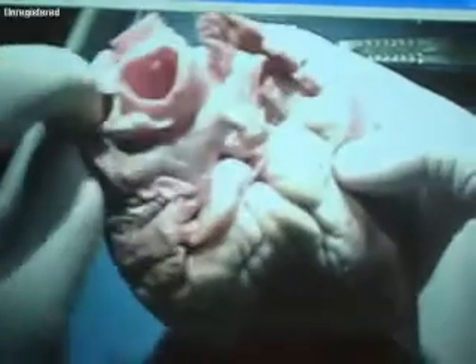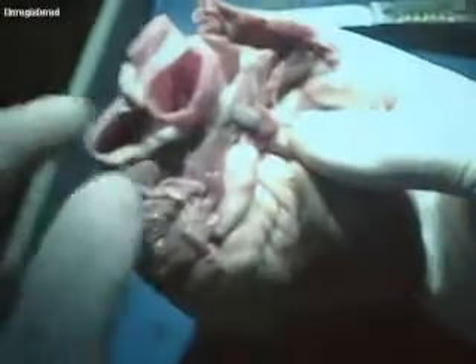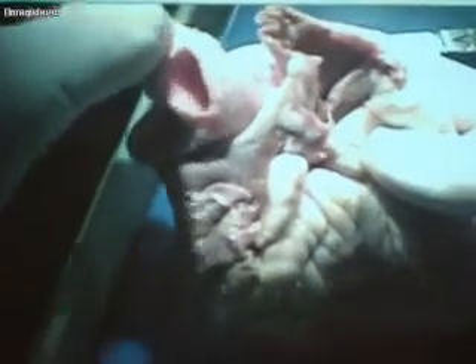Looking up at the top here, this is your aorta. This is actually the brachiocephalic artery coming out here at the top, and here's the pulmonary trunk coming up. I am not seeing either the superior or inferior vena cava — they have been cut away because the atria are actually open here. So you can see this is the pulmonary trunk, this is the ascending aorta going to become the aortic arch, and this one sticking straight up is the brachiocephalic artery.